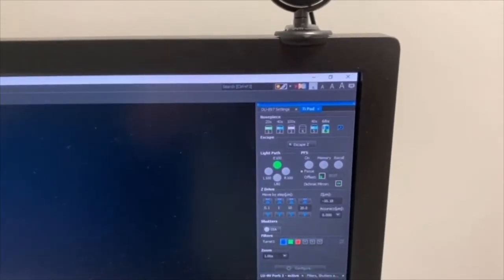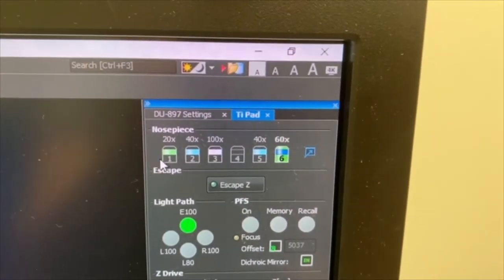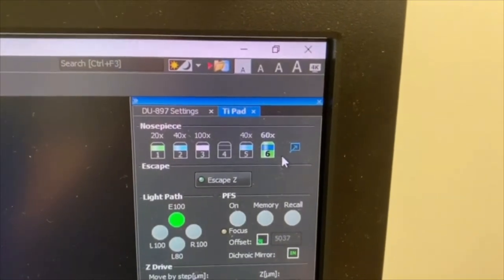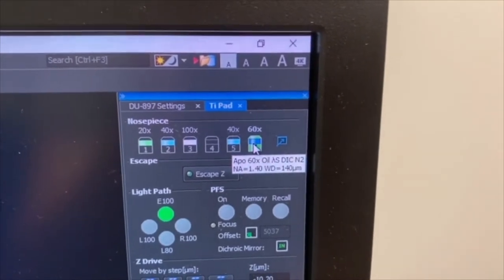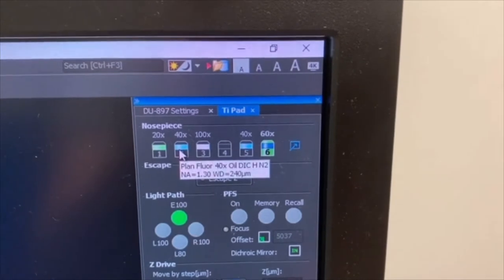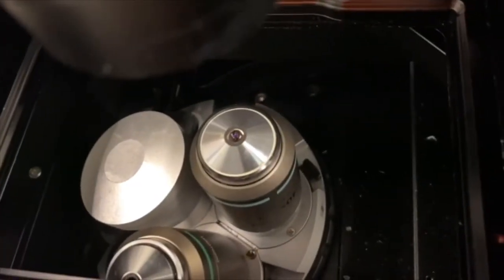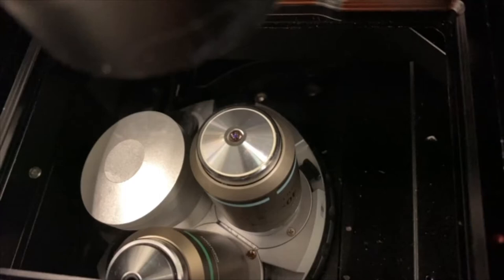Once your lens is on the very bottom, select the lens you're going to use by going into the TI pad. These are all the lenses on this machine; we're on 60x right now. If you hover your mouse over a lens without clicking, it will show the description. I want to use 40x oil, so I'll click on it and it will rotate to that lens automatically. Please check the lens carefully for any dents, scratches, or anything abnormal. If you see something, let myself or George know right away so we can track down any damage.